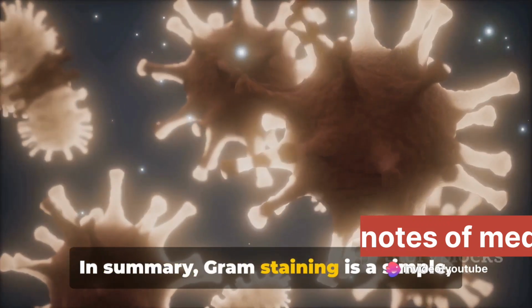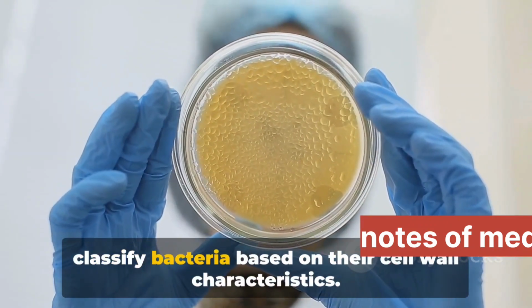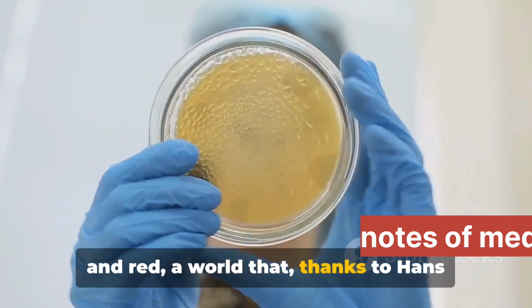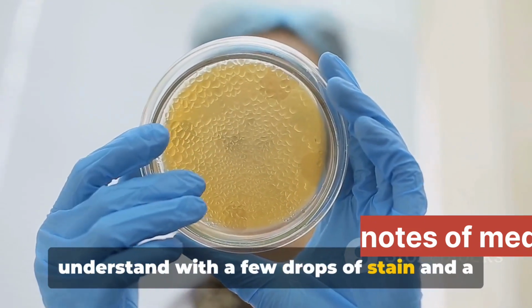In summary, Gram staining is a simple, yet powerful technique that allows us to classify bacteria based on their cell wall characteristics. It's a world painted in shades of purple and red, a world that, thanks to Hans Christian Gram, we can explore and understand with a few drops of stain and a good microscope.